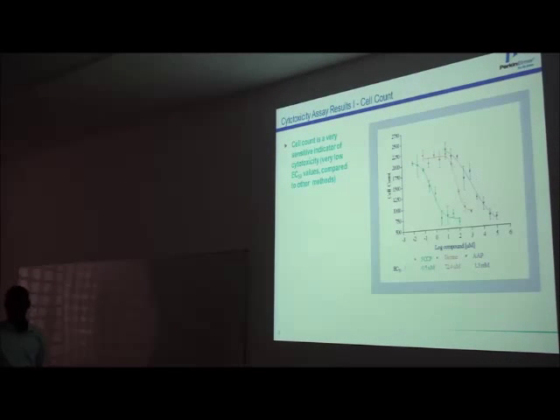So for toxicity, what we can do here, for instance, is just look at the cell count. If I have fewer cells, then there is more toxicity. Because during your measurement, for every single well, I'm taking nine fields, for instance. So the area you measure per well will be roughly the same. Right? But provided that your cell distribution is even, if you have fewer cells in one well, then you can say that probably there is some toxicity of the compound or treatment. But that's something you have to validate, and we spoke about it this morning. So the very easy way to do cell toxicity is just to count cells. And then you see that with different compounds, when you increase the concentration, your cell number will go down.